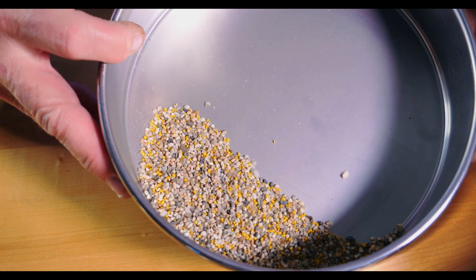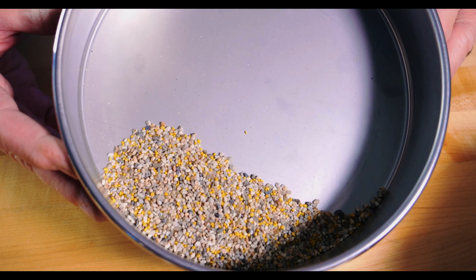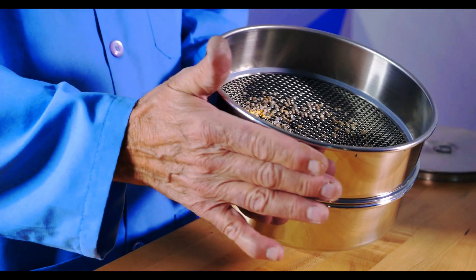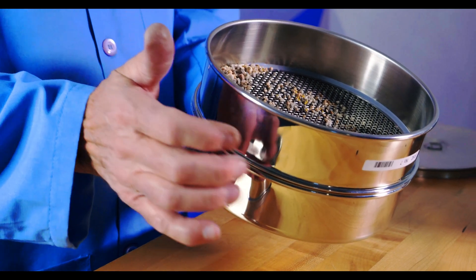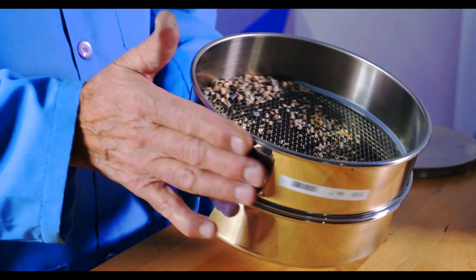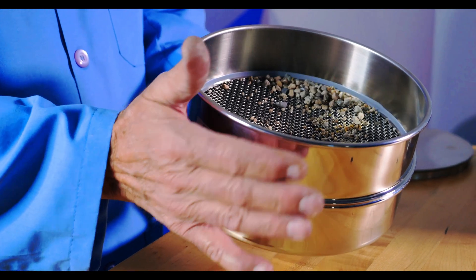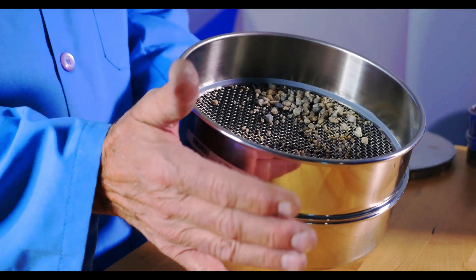Less formally, you can choose to hand sieve over a collection bucket or, if retaining the pass-through material isn't critical, it can fall right onto the ground if you're testing in the field. Regardless of whether you use a single sieve or a sieve stack, consistency is key in hand sieving. You should try to be as consistent as possible with the tapping and the rotation speed. If multiple technicians are performing and managing the hand sieve operation, varying results may be produced. To combat this, precise procedures should be written for your lab technicians.